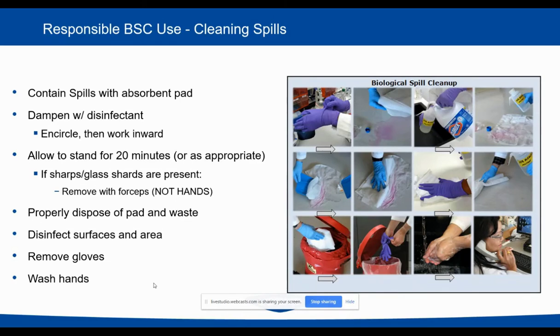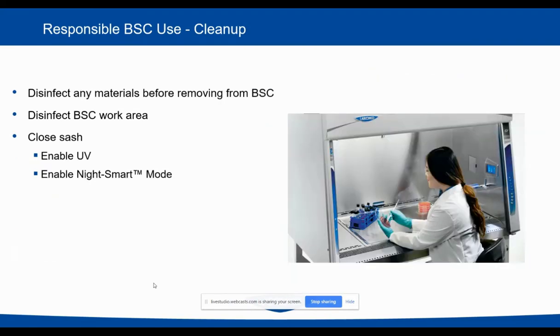Once you're done, treat the waste obviously as hazardous waste. Re-disinfect the surfaces in the area, swap your gloves out, wash your hands, and then resume work. It's imperative to follow these steps to protect yourself and also to protect your work.